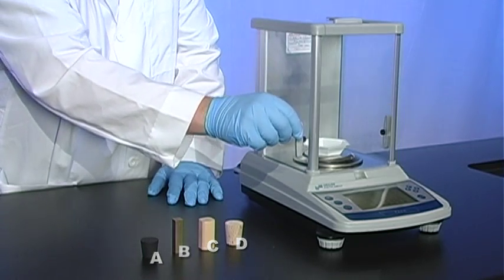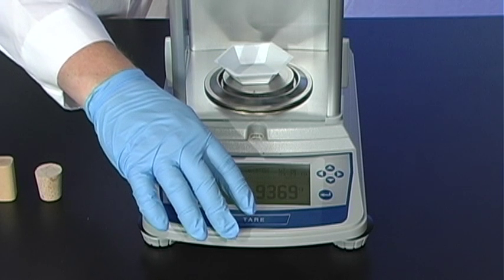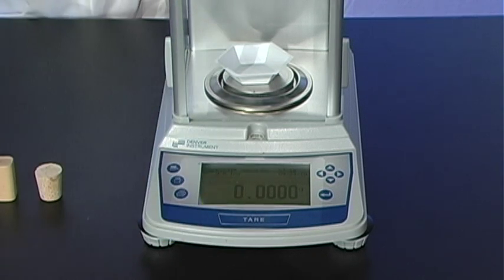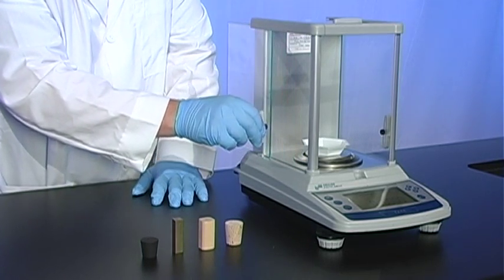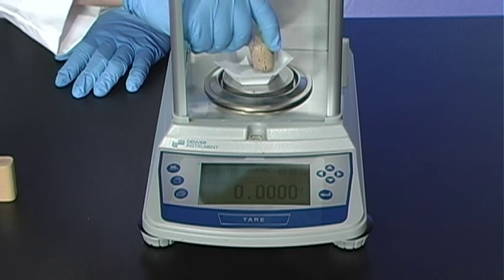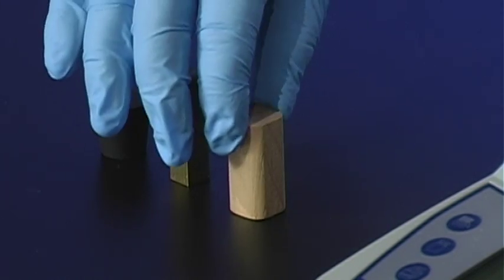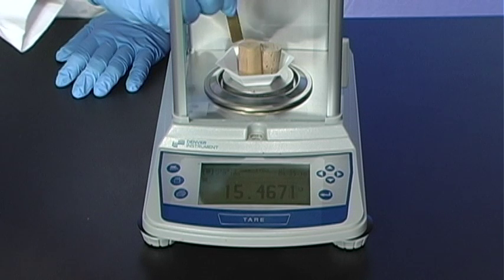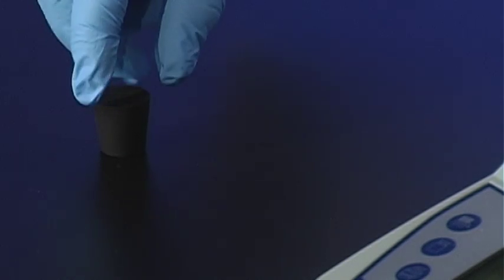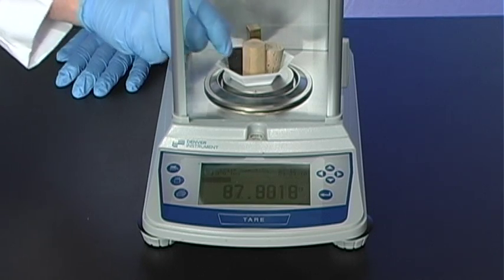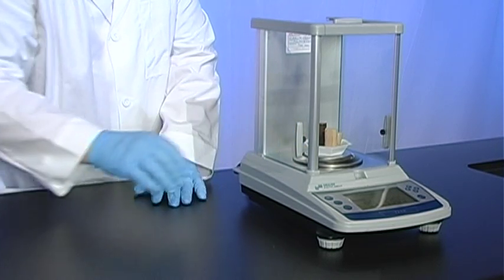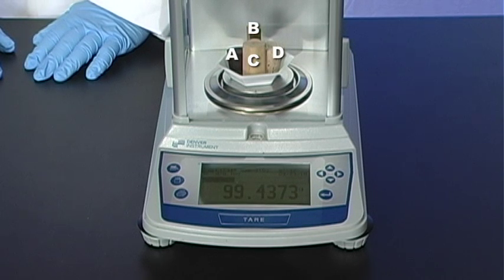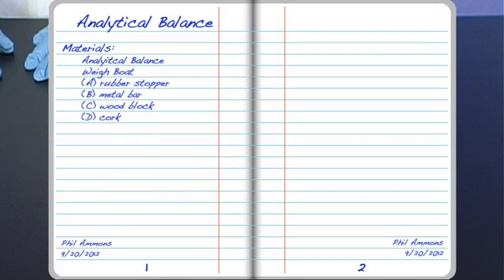First, place the weigh boat onto the balance pan and close the glass doors. Press the tare button to zero out the weigh boat. Next, weigh all four pieces together. Close the glass doors. The combined mass of all four objects is 99.4373 grams. This is called the full-scale value. Record this value in your lab notebook.